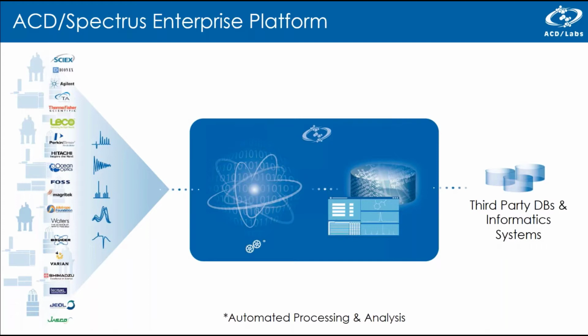And what we found from just having that capability and building upon Luminata is that we can then link it with a third-party database or informatics system. So the capability of just placing things within Luminata and linking with your notebook, LIMS system, your registration system, your registration compound name system is possible. And that's a crucial thing, having that all together in one place.